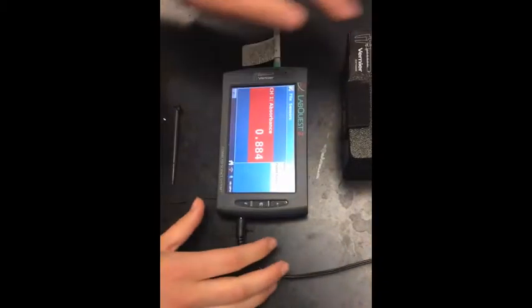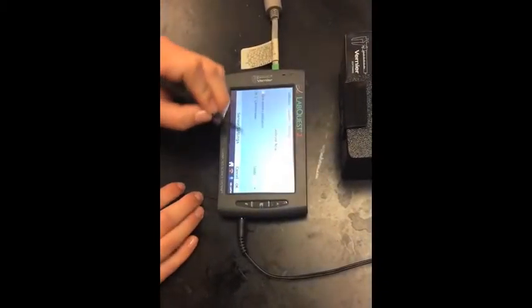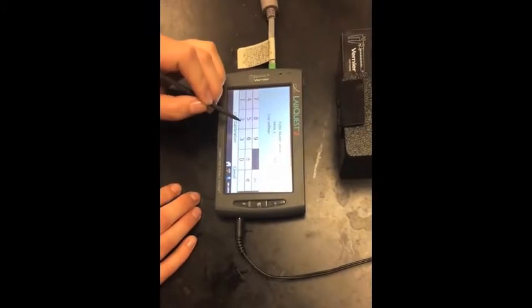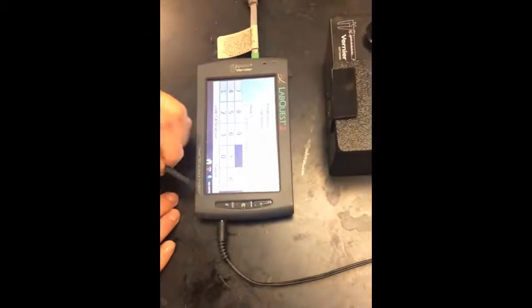Then turn the dial to 0%. Next, tap on the lab quest and press calibrate now. On the screen will appear a text box. In that box, enter 0.00.